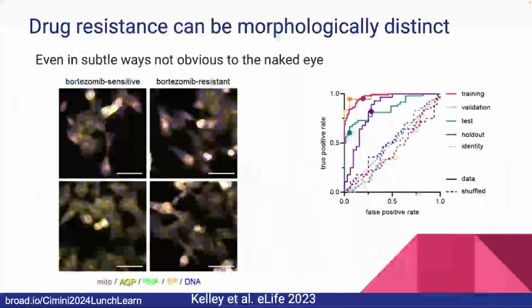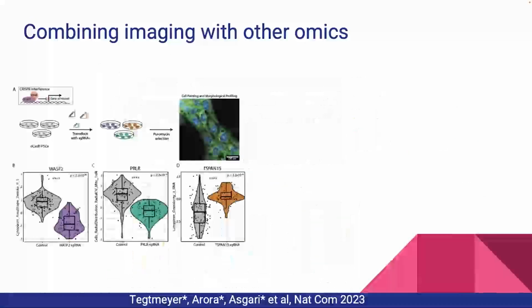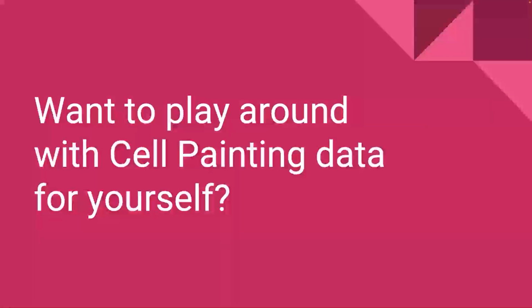This experiment here was done all by grad students hand pipetting things. It's a lot easier to do this experiment if you have a robot, but you don't need a ton of samples. And again, this was all grad students hand pipetting things. They were fantastic hands, both of them. They were really great.